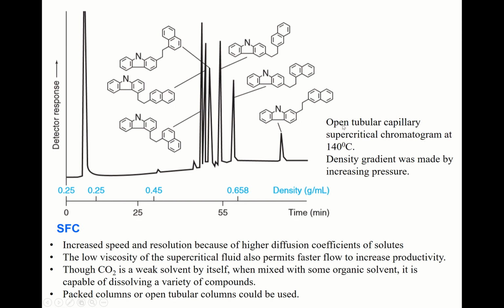Here an open tubular capillary column is used at a temperature of 140 degrees C, and a density gradient was made by increasing pressure. Look at that: all these compounds are very easily separated.